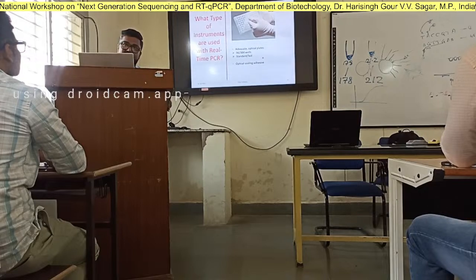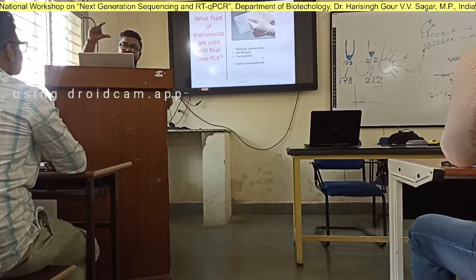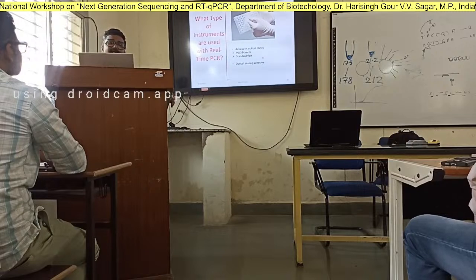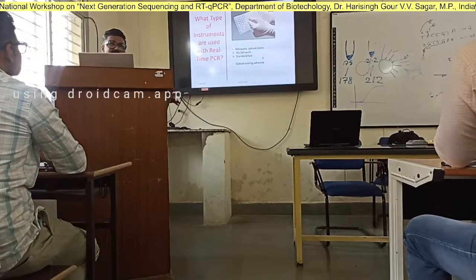The marketing people will explain it better, since they sell the product. But primarily you have the 96 format, there are tube formats, there are 8-tube strips, 12-tube strips, depending on the number of samples you are handling every day. Like for COVID-19, we use the 96 because every day you are doing 2,000 to 3,000 samples, all manually.